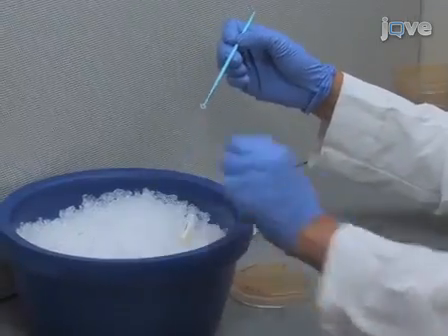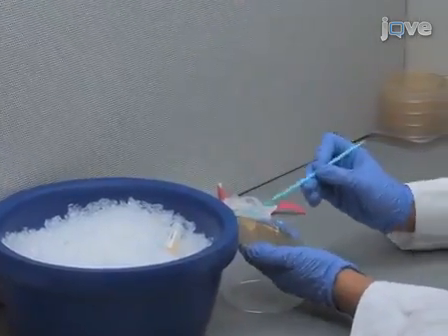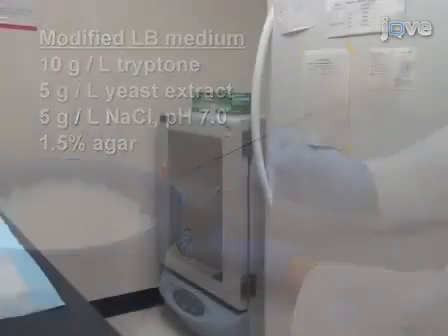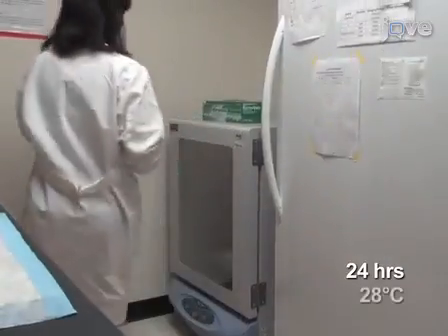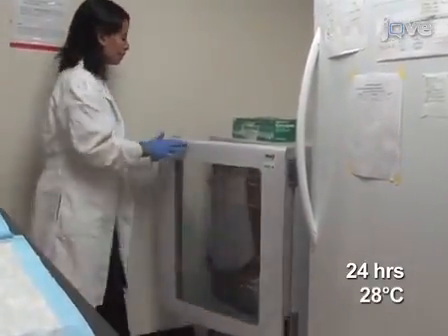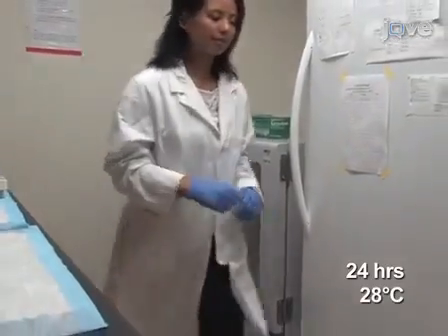Streak Pseudomonas syringae from glycerol stock on modified LB medium and incubate for 24 hours at 28 degrees Celsius. Use fresh culture to prepare the inoculum and always start culture plates from glycerol stocks as bacteria become less virulent.